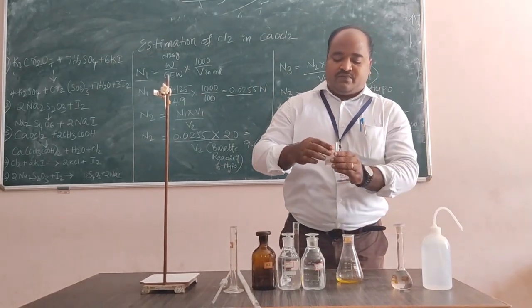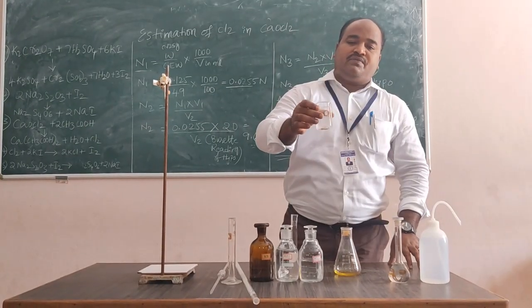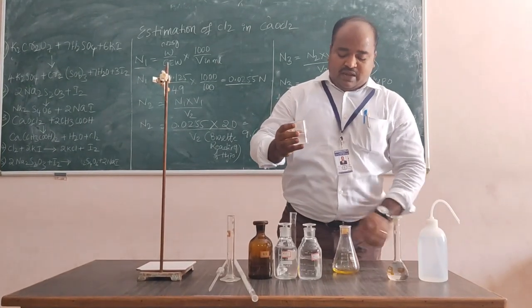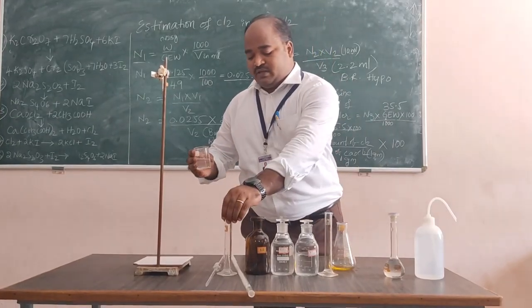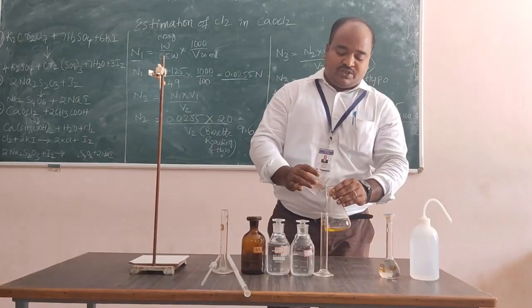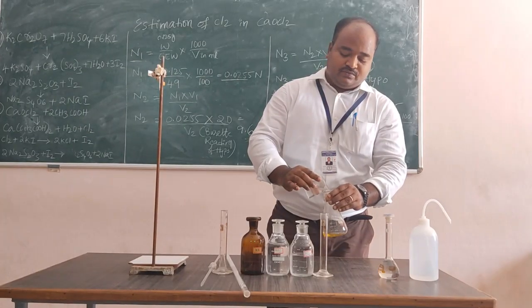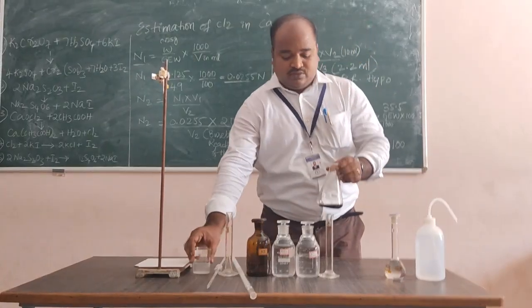And 2 ml of starch solution. I am going to add approximately 2 ml of starch solution. I don't have a proper measuring cylinder, so I am adding approximately to this solution.